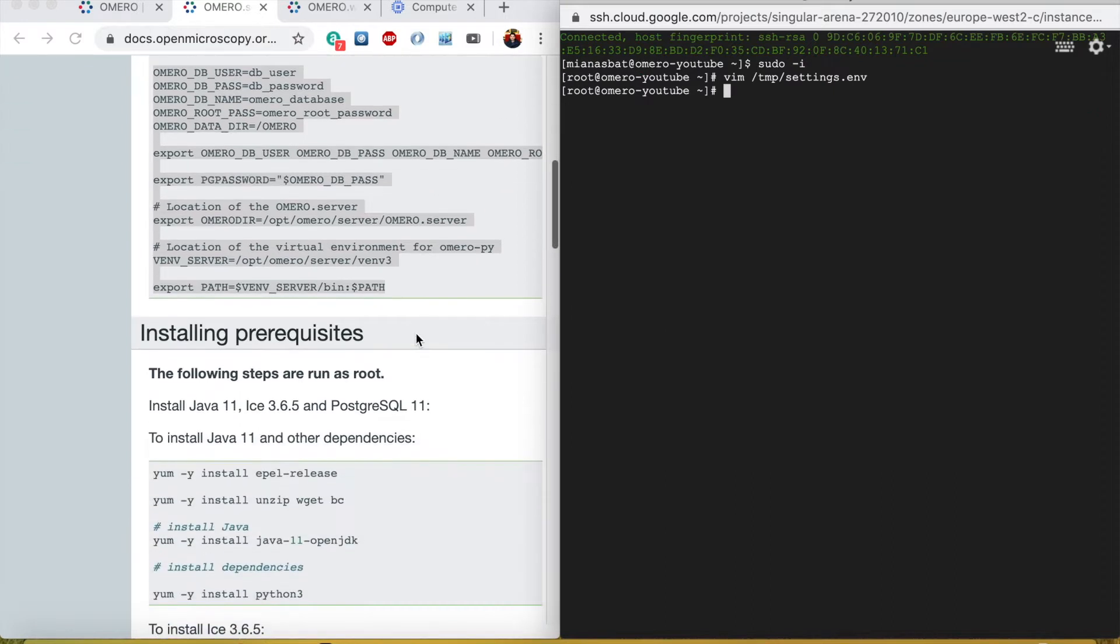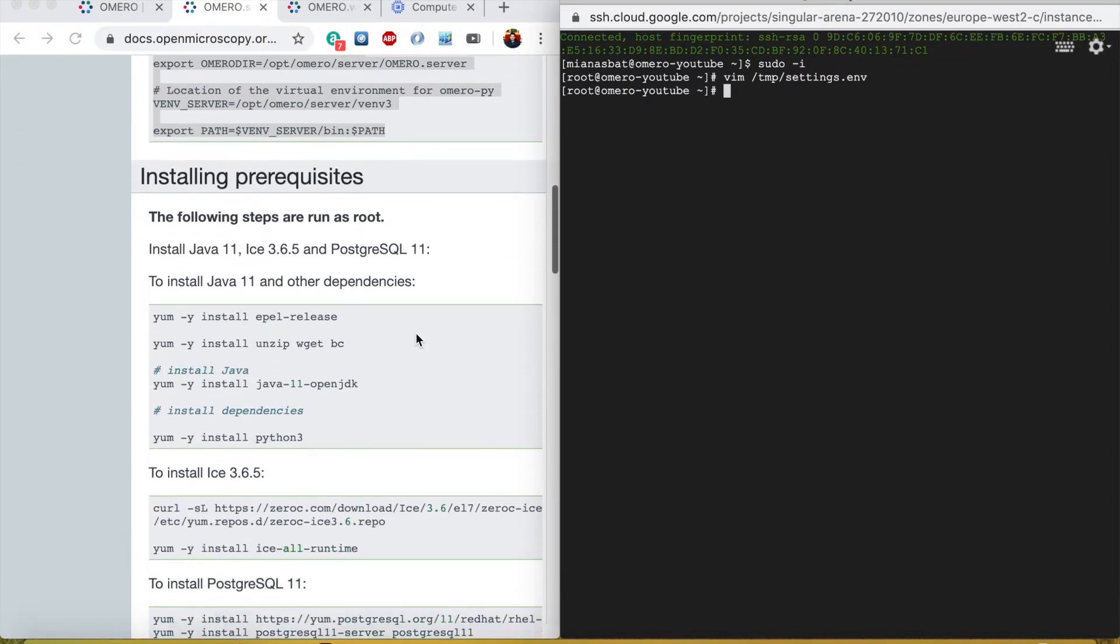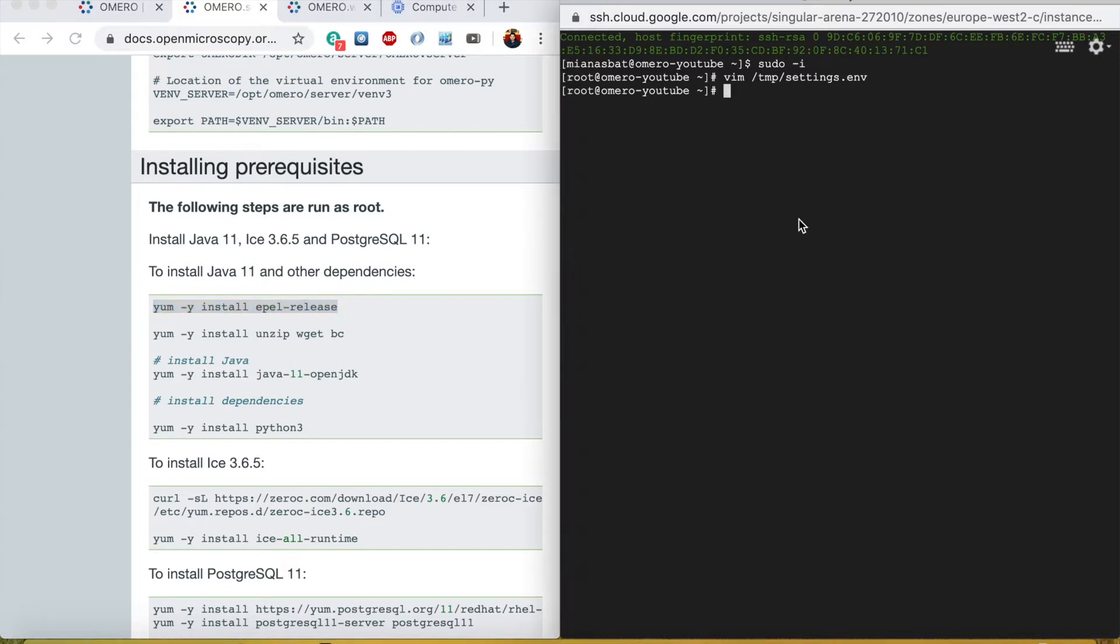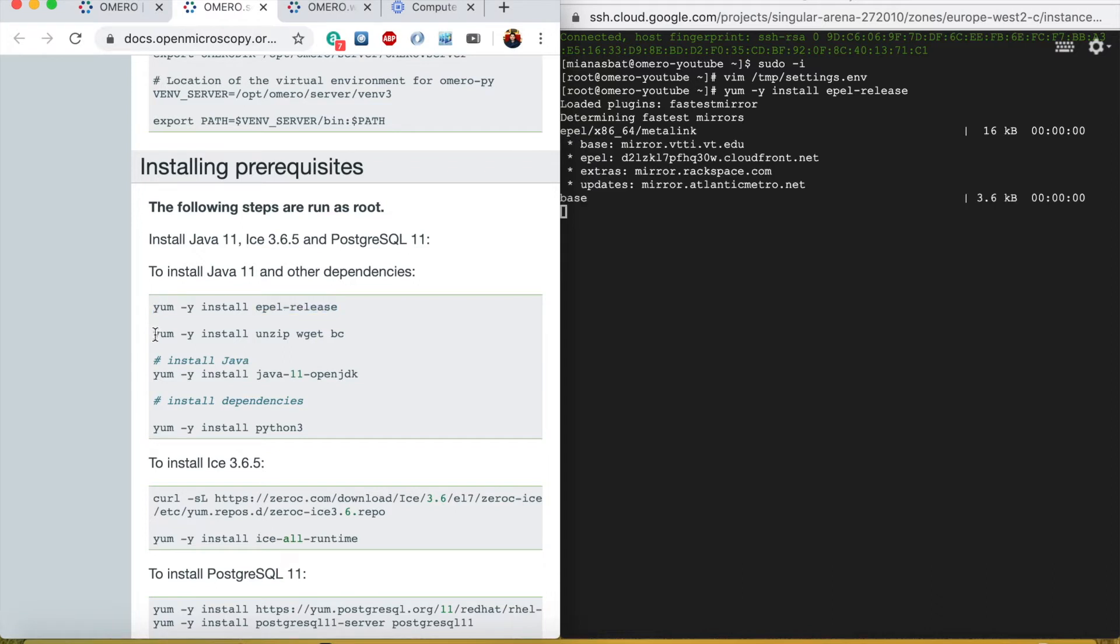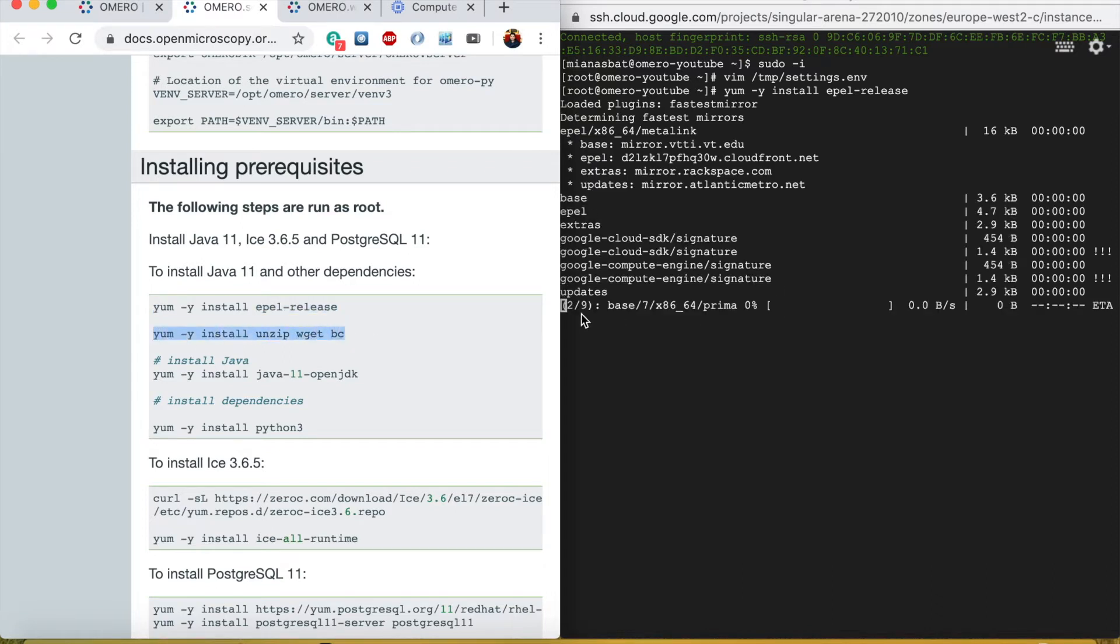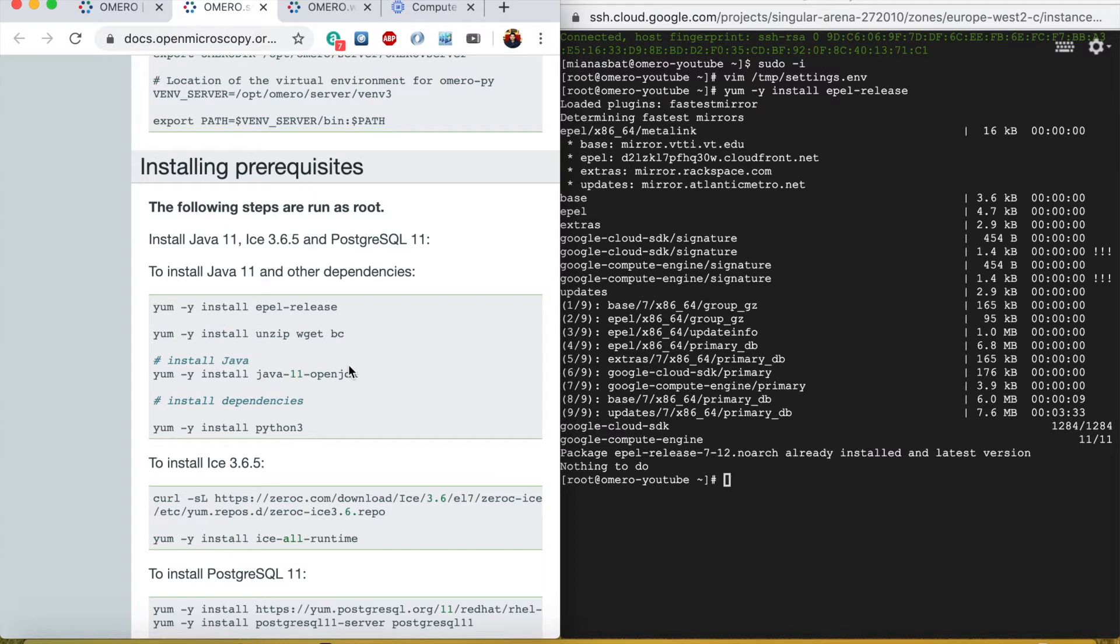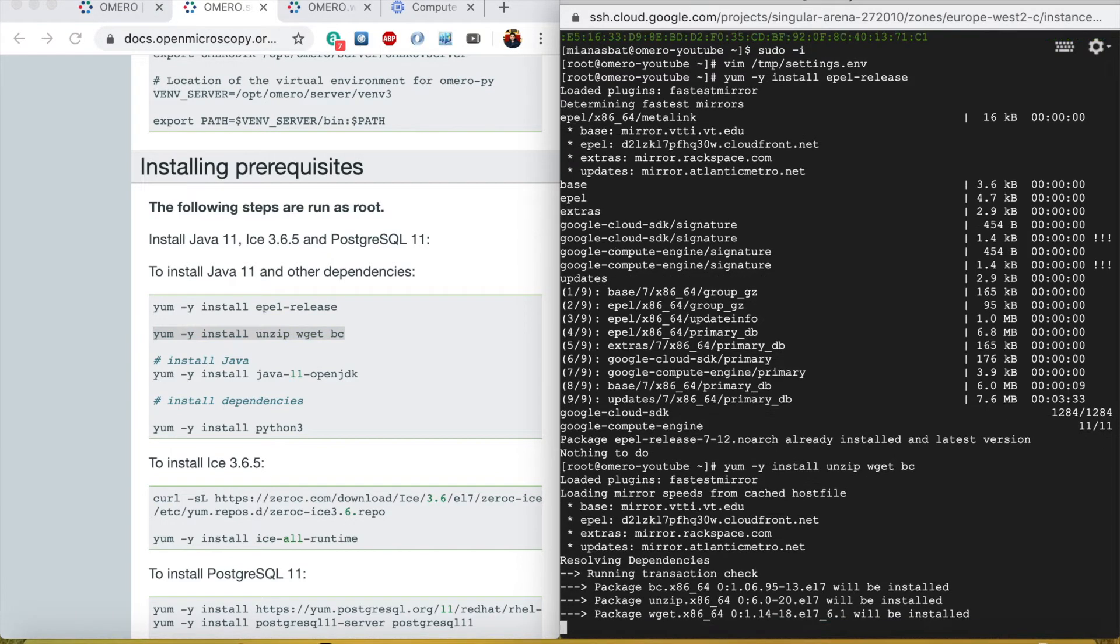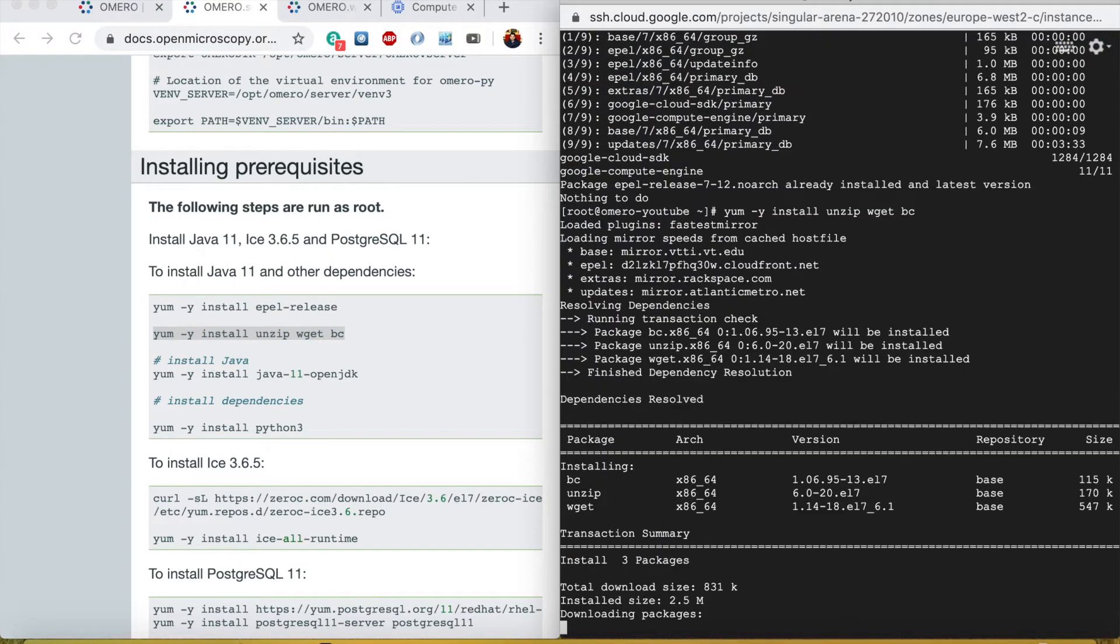Now I will install these requirements. Let's do this and the second one.